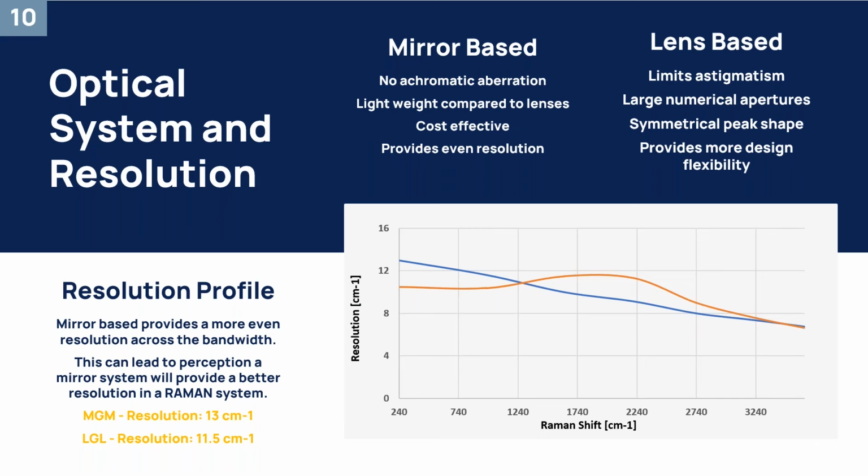And that's something to consider, because having just a single data point telling you that the resolution needs to be below 10 inverse centimeters or something like that doesn't necessarily tell the entire story. So it would be advantageous to always look at what portion of the spectrum you are in need of this resolution. Where is the most information packed, essentially?